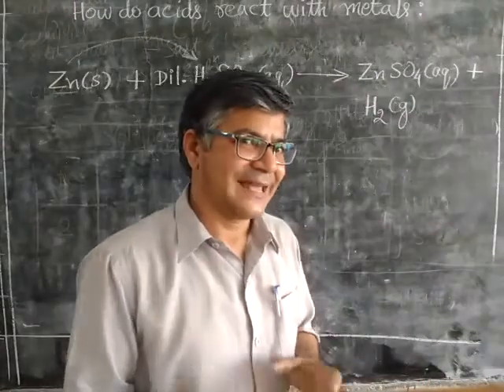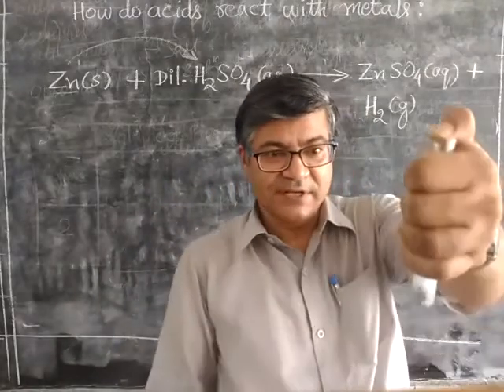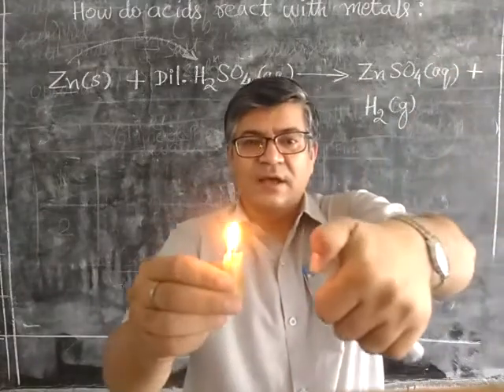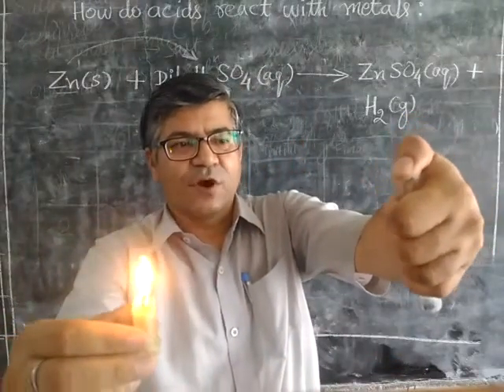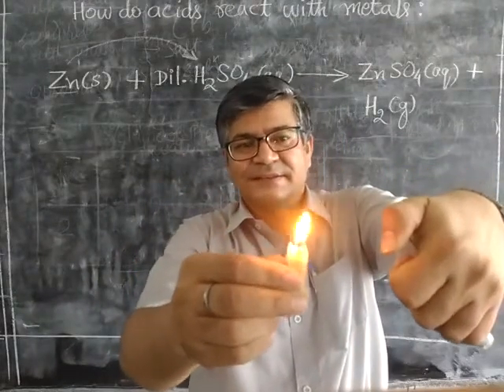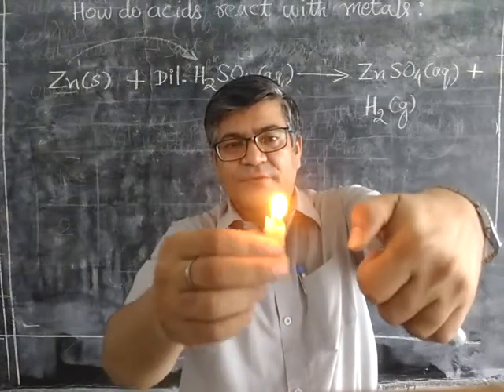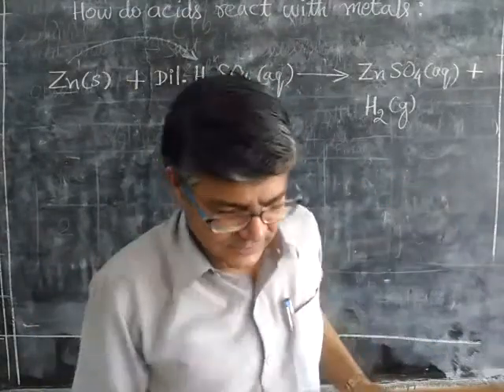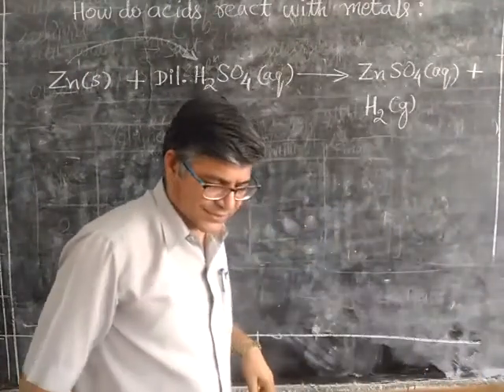So we have just heard and seen the reaction taking place. I'm going to try it once again. Now the reaction has increased very rapidly to a higher extent once again. It depends on how long I can hold the bubbles inside the test tube. The gas is being liberated and it has to be burnt. If I do that again, it pops out. So you have to be careful while dealing with such reactions.